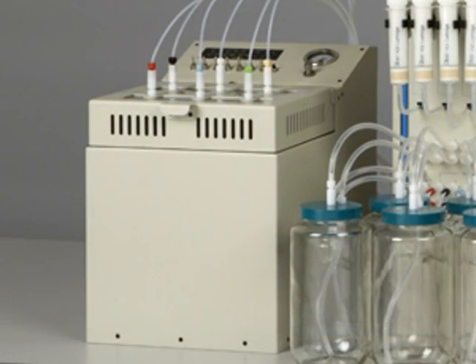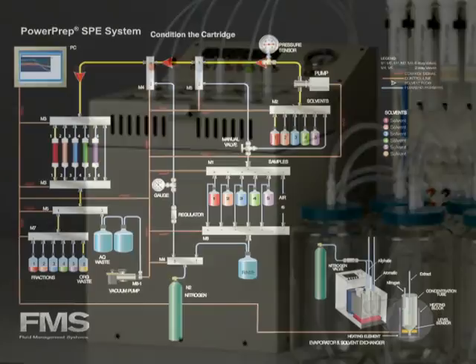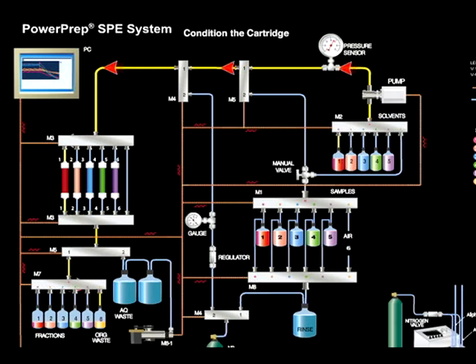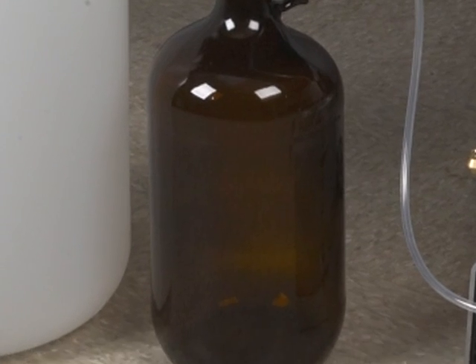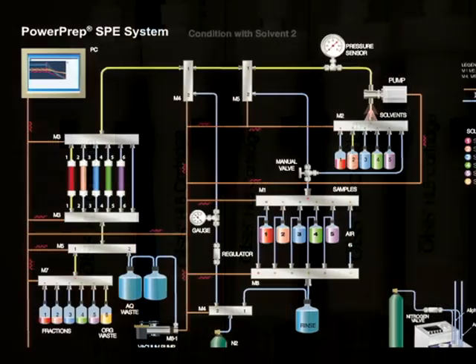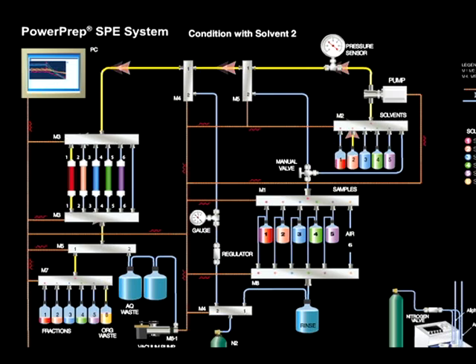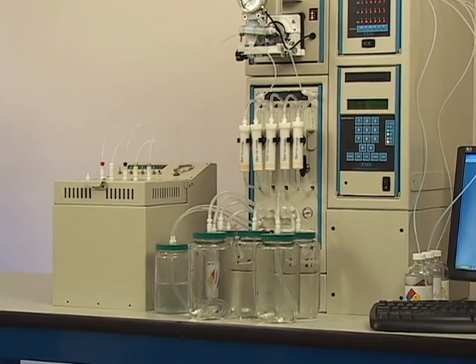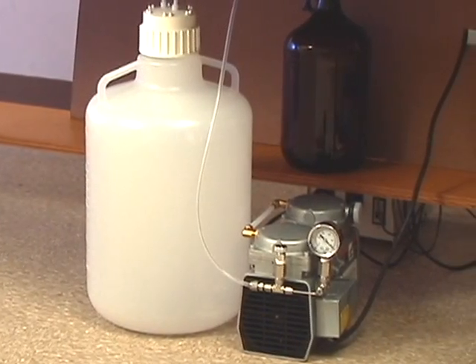The concentrator is turned on automatically by the software. The SPE system conditions the SPE cartridge with the first solvent, methanol. The solvent is sent to the organic waste reservoir. The SPE system conditions the cartridge with a second solvent, water. The SPE triggers the vacuum pump to start loading the sample into the SPE cartridge at a rate of 100 milliliters per minute. A 1 liter sample loads in 10 minutes. The water sample waste is sent to the aqueous waste reservoir.